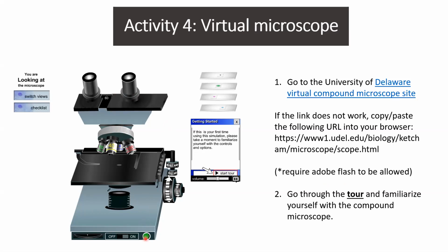Very briefly, you will need to turn your microscope on. This will allow the light to come from your microscope through the diaphragm. You will want to adjust your lighting. I usually start off somewhere in the low to medium range. And then you adjust your diaphragm, your aperture setting, so you determine how much light you want to let in.